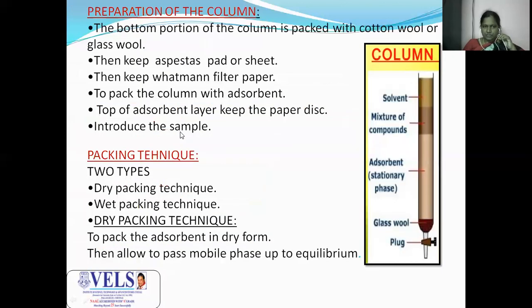The next part is preparation of the column. In this preparation, these are the steps involved. First you keep the glass wool, then you pack your adsorbent. After that, you add the mixture of components. Then you pass the solvent continuously through the column.